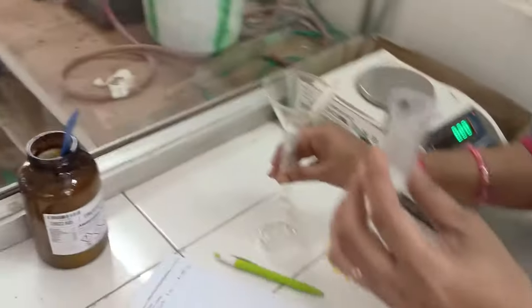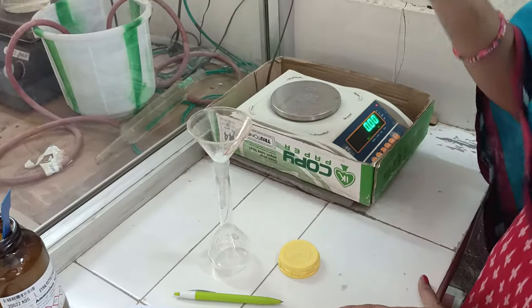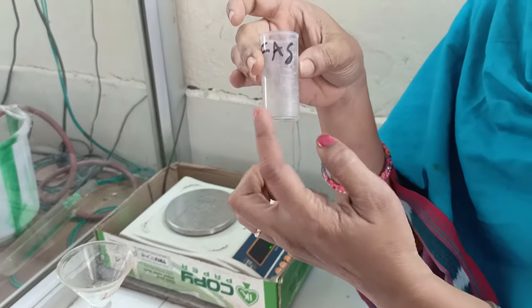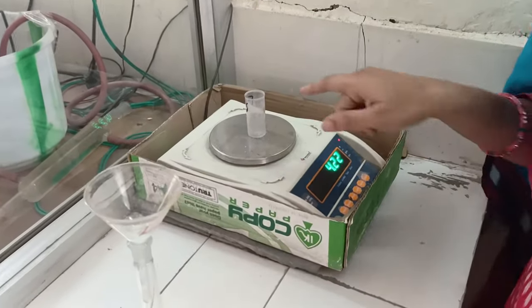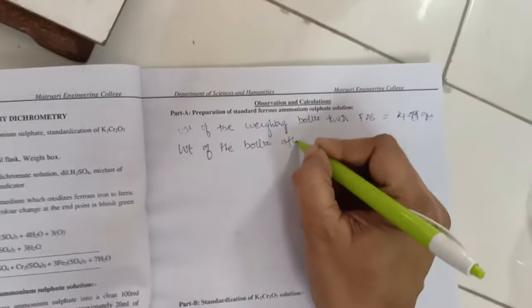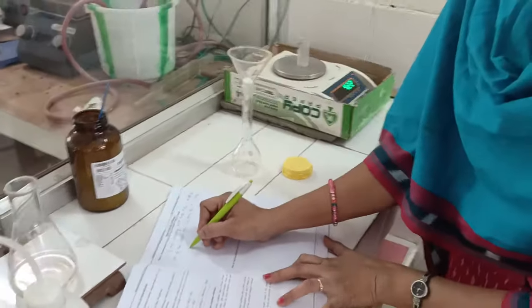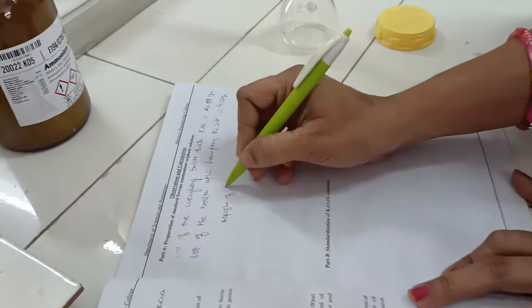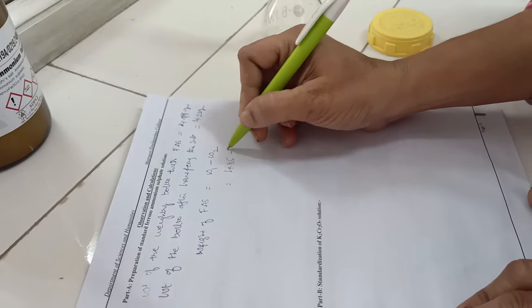Now immediately transfer this sample into the standard flask with the help of a funnel. After you transfer, the bottle is not empty because it has some amount of salt remaining. In order to know how much salt has been transferred, you need to know the weight of the bottle after transfer. The weight of the bottle after transferring the salt is 4.22 grams. So the weight of the ferrous ammonium salt is W1 minus W2, that is 4.85 minus 4.22 grams.